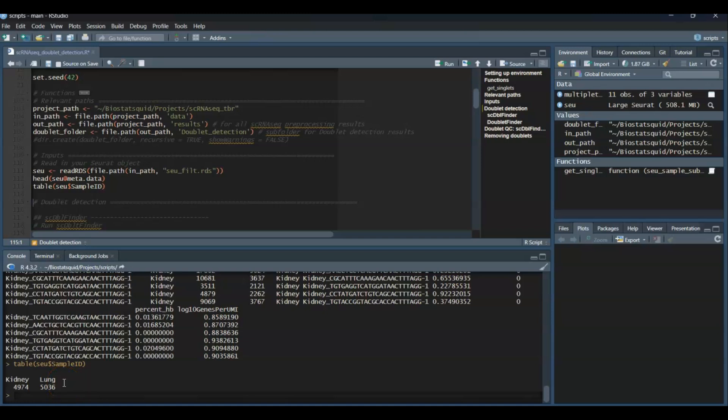This is important because most doublet detection tools work on a per sample basis, meaning that if your Seurat object has more than one sample, you need to split it, find doublets in each of the samples, and then merge the datasets again. In this tutorial, I will use code so that it works if you have more than one sample.